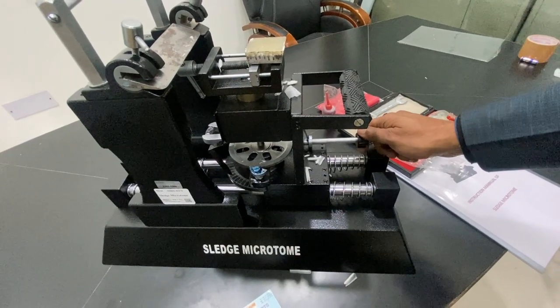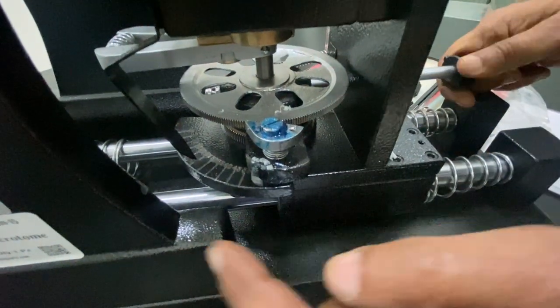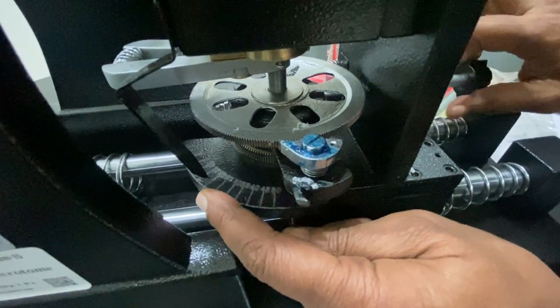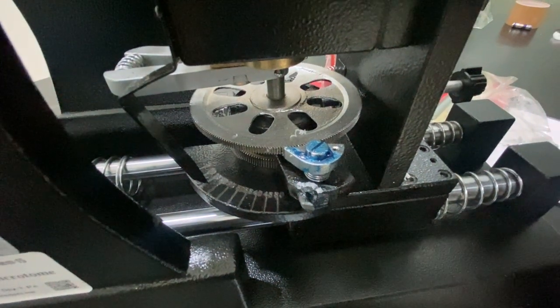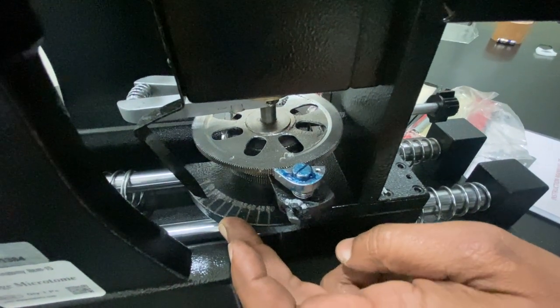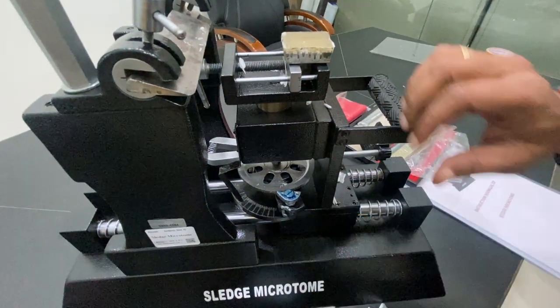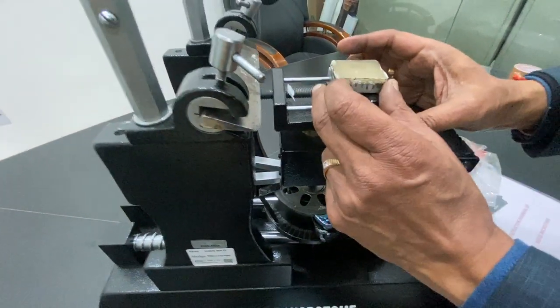This one is for thickness creation. You can see as I move it to the right side, the thickness of the sample will increase. As I go down, the thickness will go down. It decides whether the cut section is going to be thicker or thinner. Initially, you can use the higher sample thickness. When it starts coming, then you can use a thin sample, say 5 micron or 1 micron or 2, 3 micron, 10 microns. And there is another adjustment, this block.